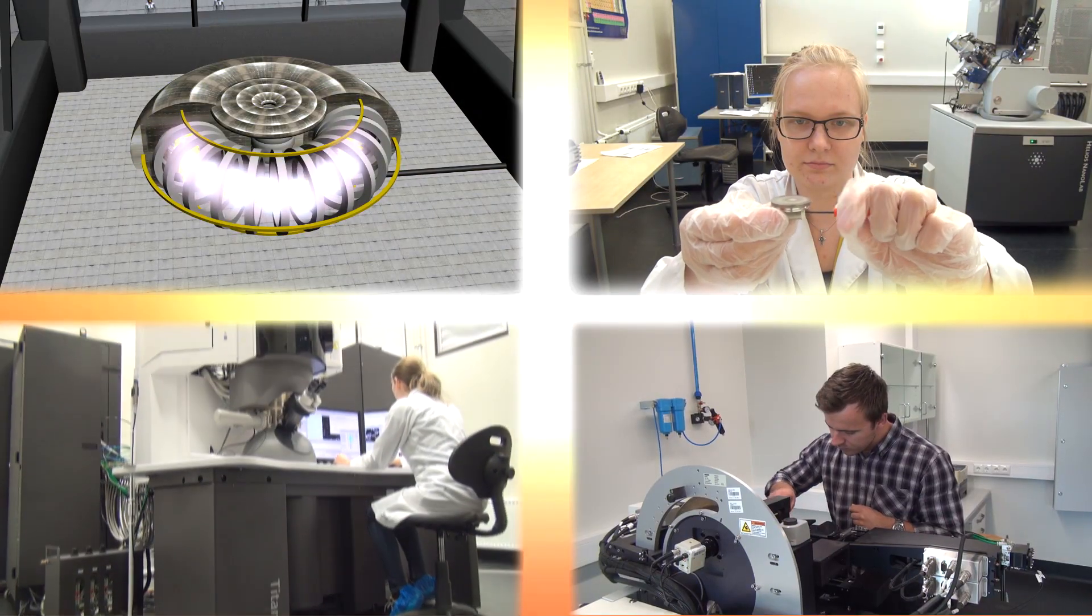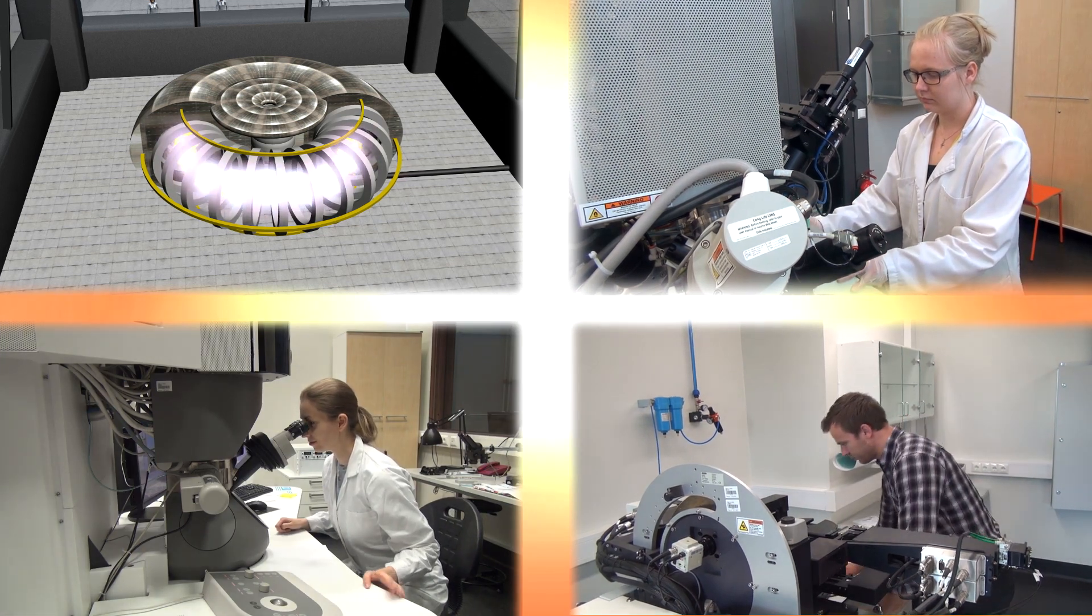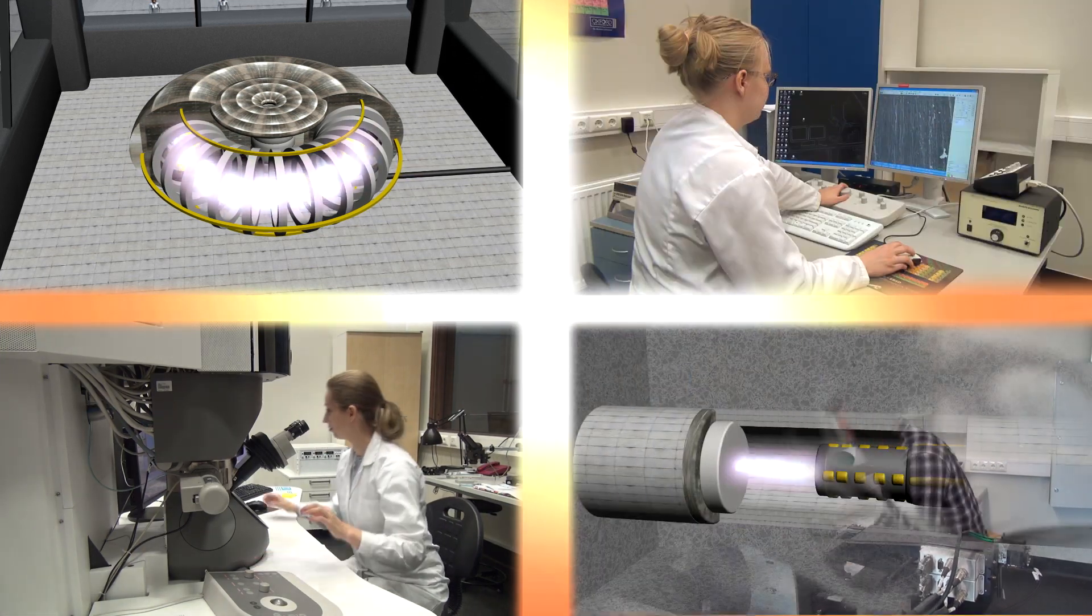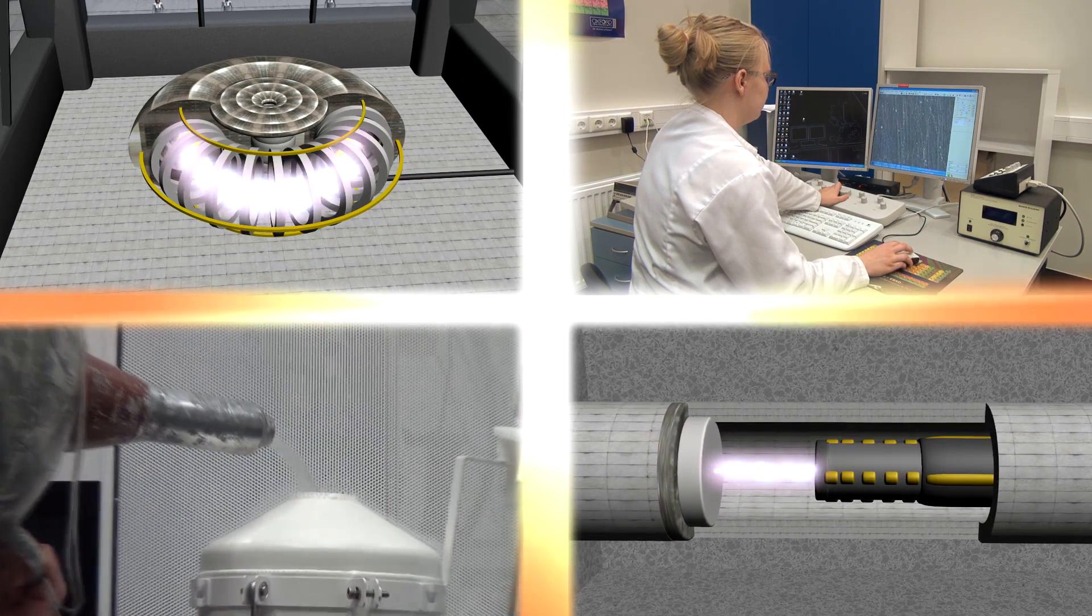In order to overcome this challenge, the scientists have to test and develop different materials to find the most suitable one to be used in a real fusion reactor, when the time finally arrives.